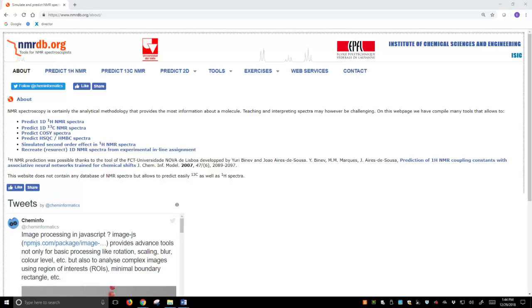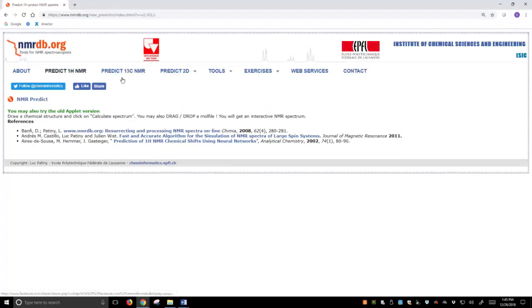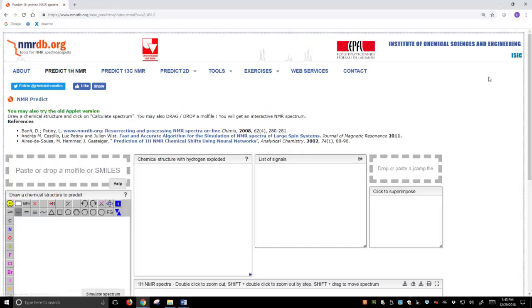So we're on the homepage of nmrdb.org, and we want to click on Predict H1 NMR, Predict a Proton NMR, and here comes the webpage that contains all the tools.